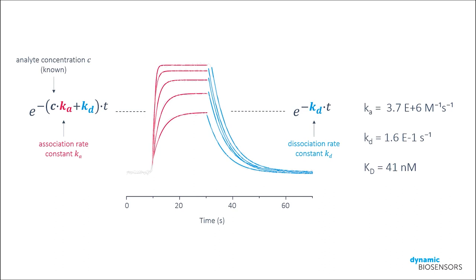As I've mentioned before, in principle it's not necessary to perform multiple injections, but we can see now why doing so improves the accuracy of the analysis. The fit algorithm considers a number of different experimental conditions simultaneously, and when a unique set of KA and KD values is found that match all data, we can have high confidence in the quality of the extracted rate constants. Regarding the fitting model that has been used here, it's the most basic and also most stringent model with a minimal set of free parameters that can be employed. When it comes to fitting free parameters to measurement data, without a doubt, less is more. And because our dataset beautifully follows the theoretically expected single exponential behavior, we do not have to resort to, for instance, mass transport limited models, which are often used in literature to account for measurement artifacts.